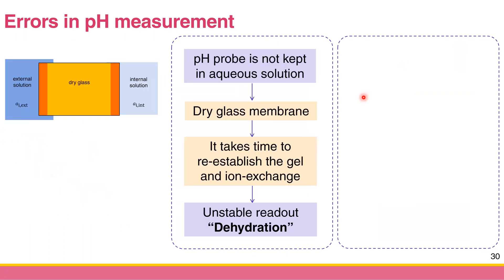The third error is dehydration error. Ion exchange occurs only in the hydrated gel layer of the glass membrane. If the glass membrane is too dry, it takes time to re-establish the gel and the ion exchange equilibrium. You'll get an unstable readout for a period — maybe 10 to 30 minutes. A user who doesn't know this might record that unstable readout, giving incorrect results.